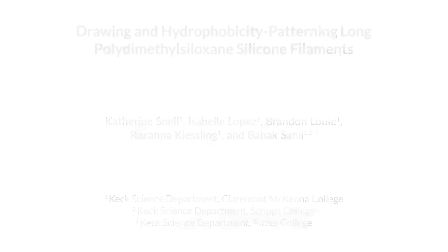Polydimethylsiloxane is a versatile material that could not be formed into long filaments until now. While silicone filaments may have applications in weaving or additive manufacturing, we are particularly interested in them as a model folder. Scalable production is enabled by drawing already curing silicone through a tube furnace. We also demonstrate a way to modify the surface of the silicone filaments using a computer controlled corona discharger.